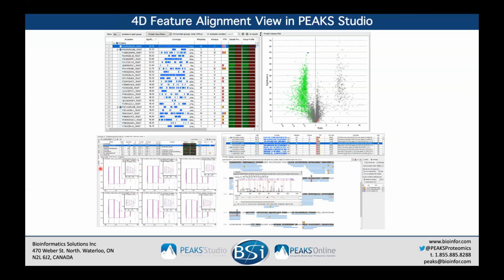And so what you can see here is the top represents one set of samples and the bottom one set of replicates, and the features are primarily the same shape across all of the samples, and we're seeing the isotopic distribution that we would expect.